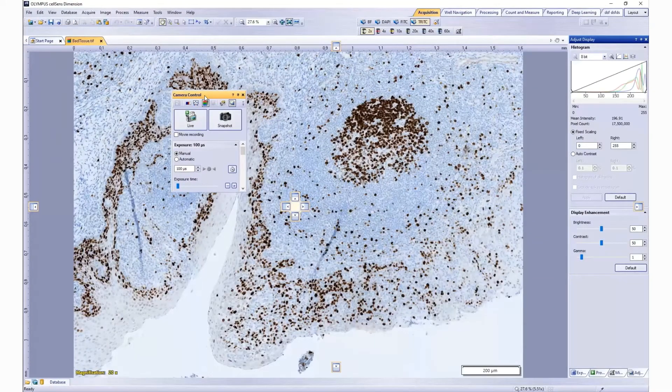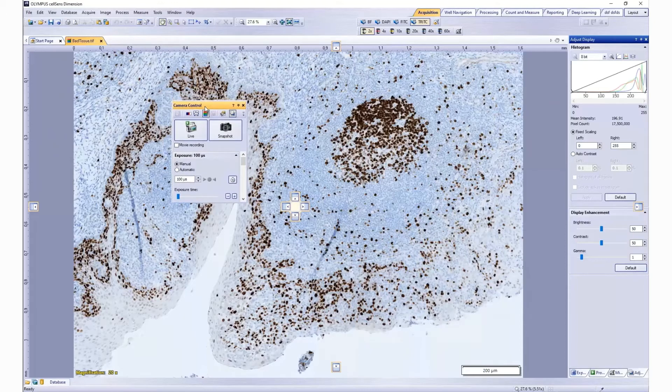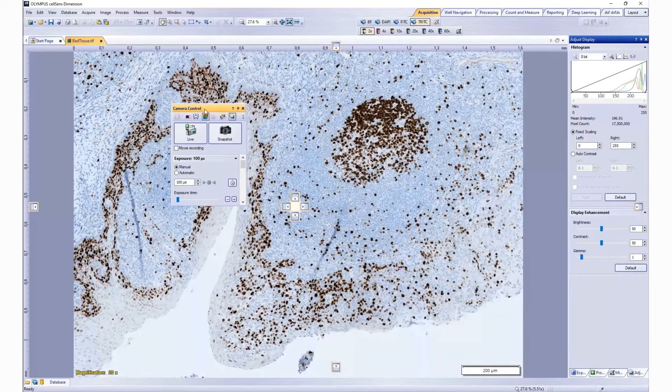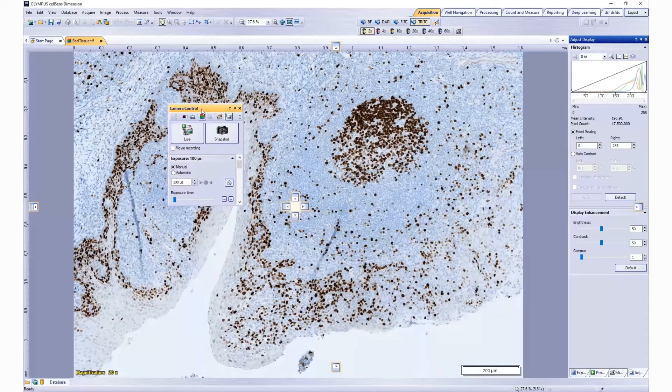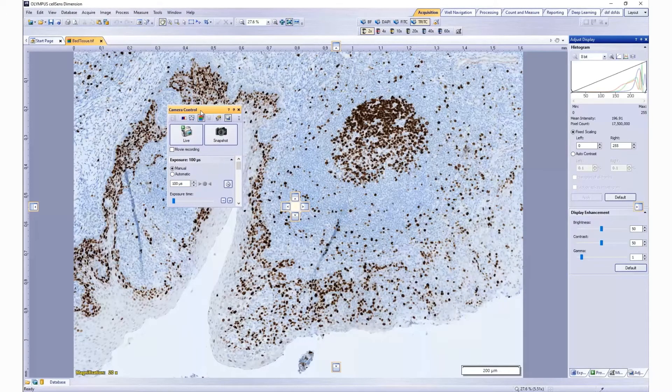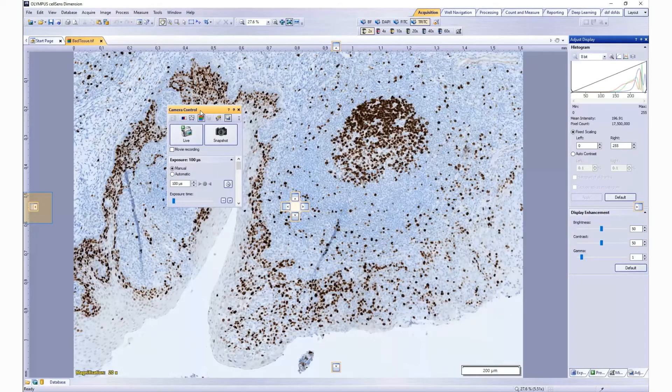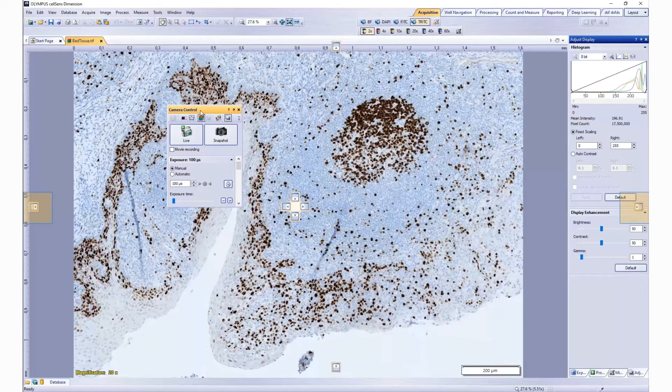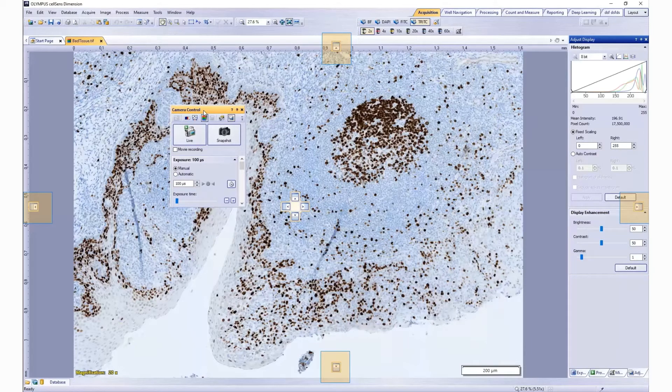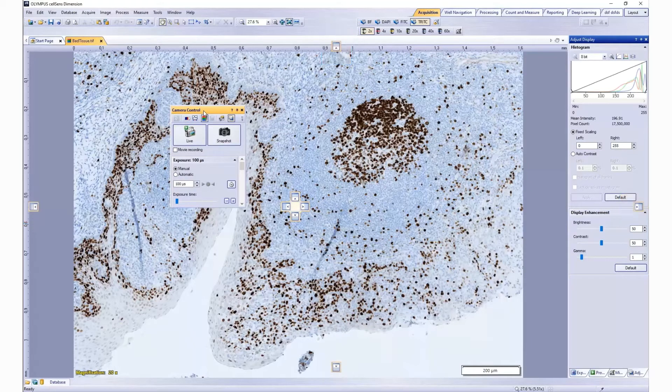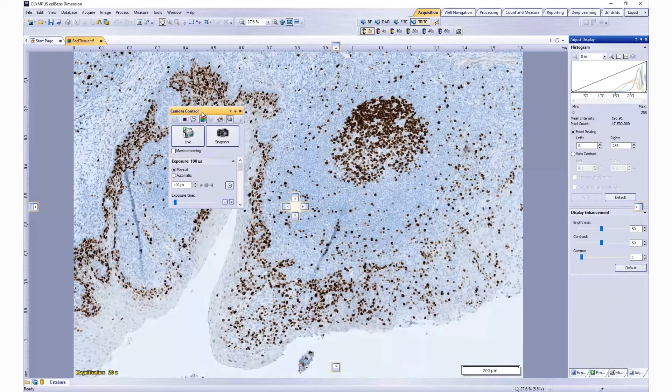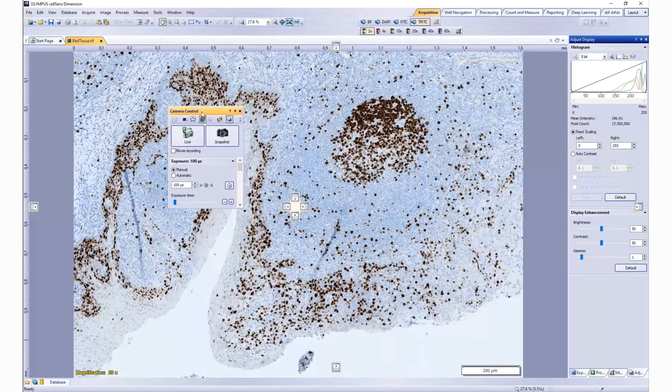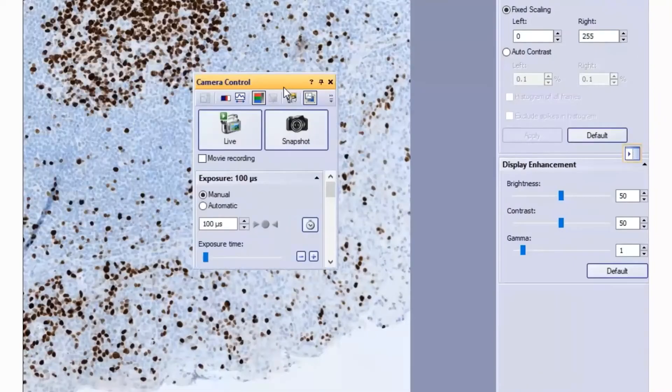You can also dock a tool window. While holding the header, you will see a number of layout placement icons. This will allow you to dock it to the left, right, top, or bottom of the program interface. If you want that tool window to show as a new tab on an existing tool window, float it over the existing tool window.